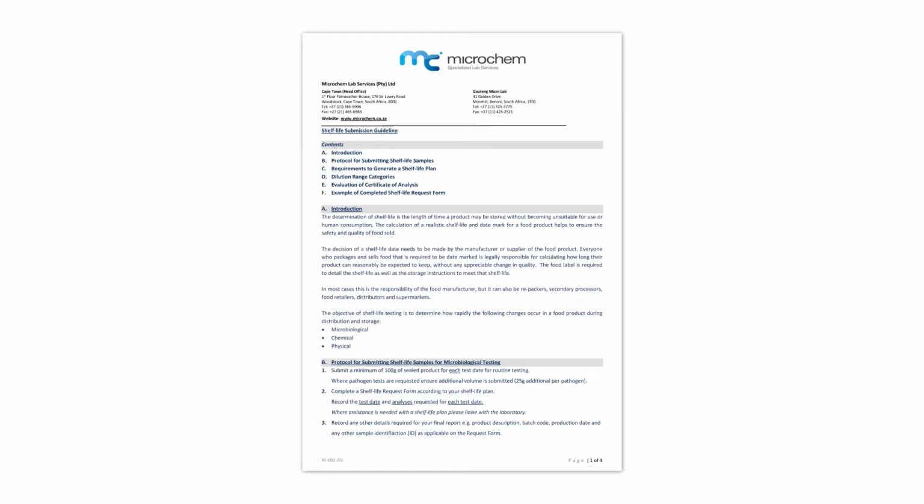Shelf life submission guideline. The determination of shelf life is the length of time a product can be stored on the shelf until it becomes unsuitable for human consumption. The decision of shelf life needs to be made by the manufacturer or the supplier of the product. Everyone who packages or manufactures food is legally required to calculate the shelf life of their product. The food label is required to detail the storage and shelf life of the product.